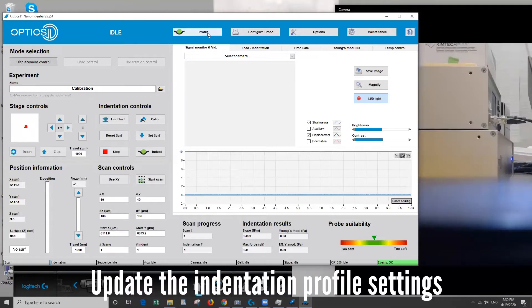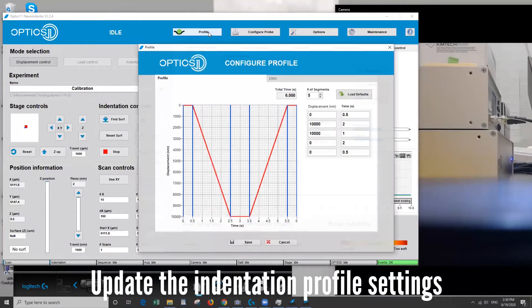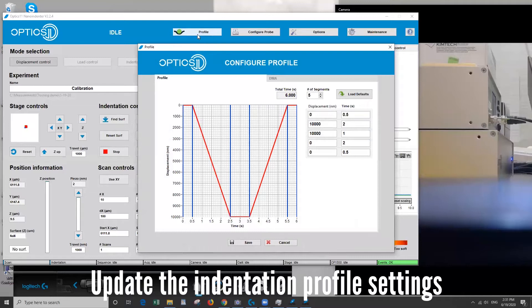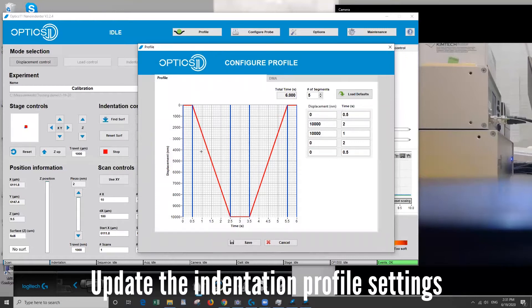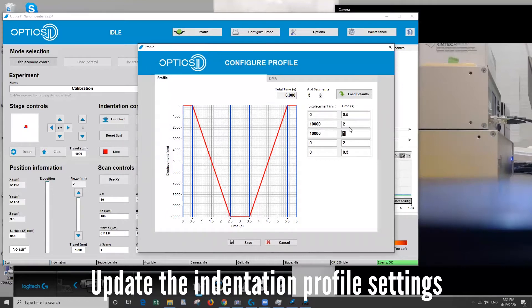All right, so the next thing we want to do is come up here and go across the top and check our profile is set to the defaults. If you want a different indentation profile you can just change any of these to be whatever amount of time per segment or displacement that you want. 10,000 is the max so we'll just leave it at that for now.